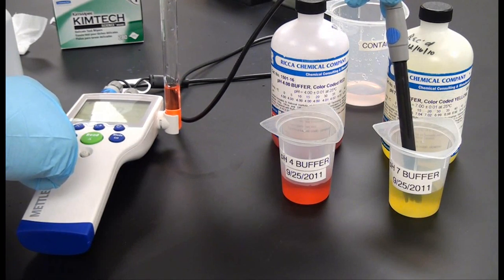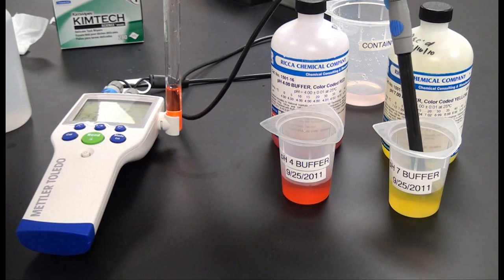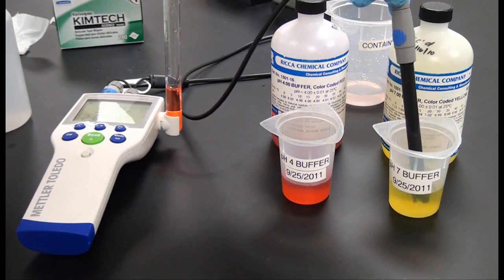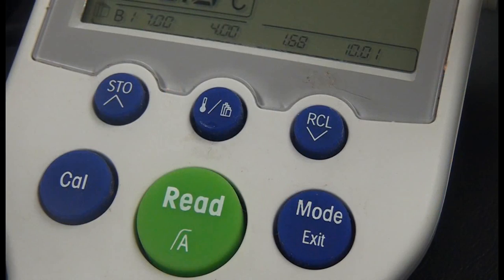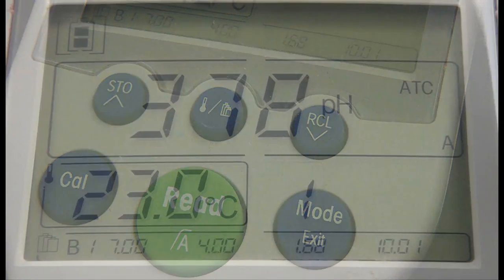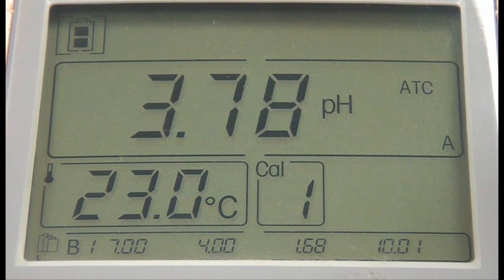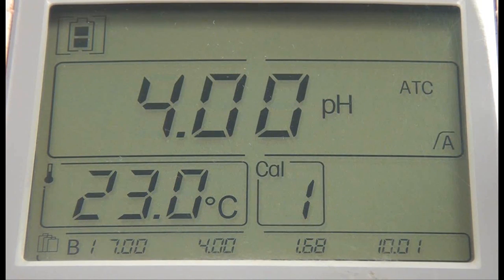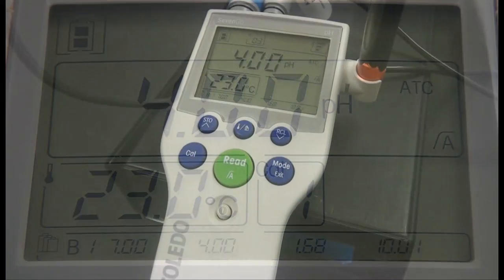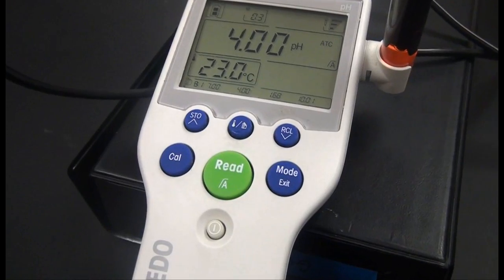The SG2 self-calibrates after the signal from the probe is stabilized or after pressing the read button. The meter displays and freezes the relevant buffer value and updates the calibration adjustment on the display. To accept the calibration and return to sample measurement, press the read button.